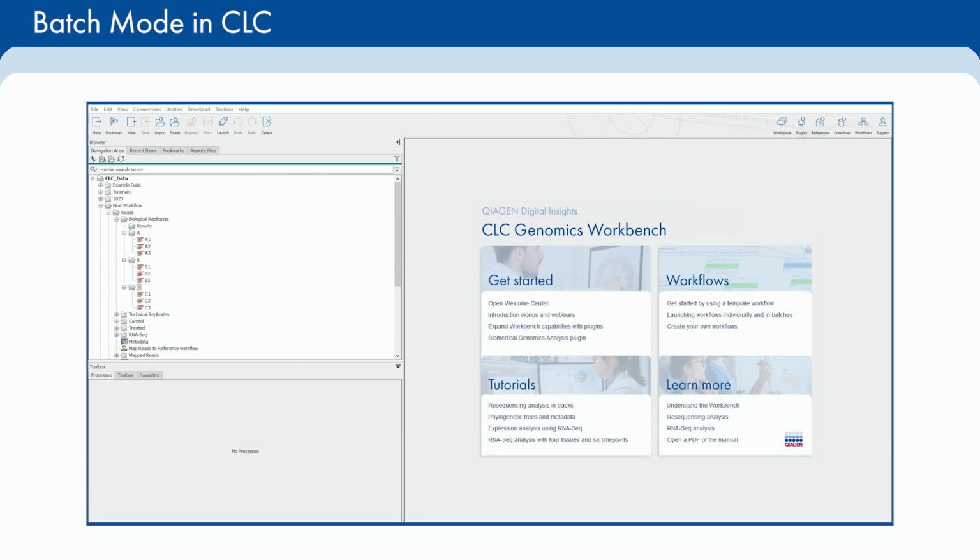In this first example, each set of reads corresponds to a biological replicate. These reads are arranged in folders A, B, and C. Our goal is to map the reads and output a reads track for each sample to be used in the downstream analysis.